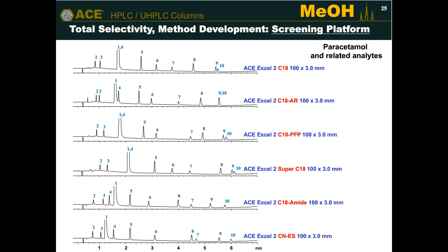For unknown samples, unknown compounds with LC-UV, it's a bit trickier if you don't have MS available, but you can still do it because I've done it for many years that way too. You use different column chemistries and you use peak area and try and map between the different elution and retention times, and try and match the peak areas as best as you can when you have unknown compounds. But in an ideal world, especially for unknowns, you really do need ideally a single quad type instrument, an LCMS single quad instrument. Of course, anything more powerful than a single quad is great if you have that type of capability in your lab.